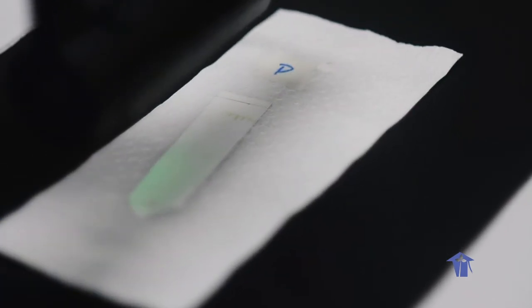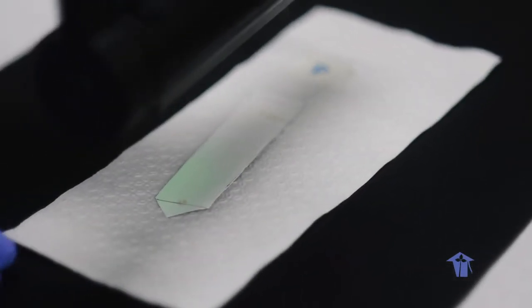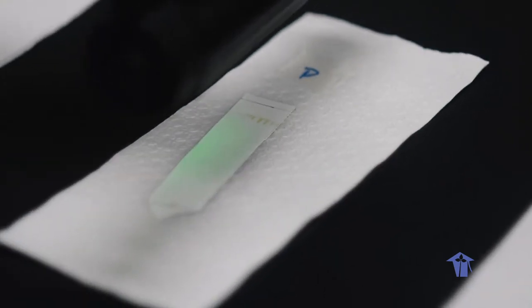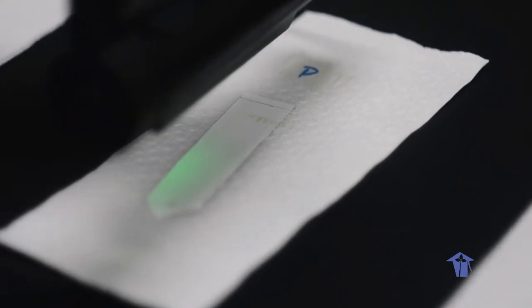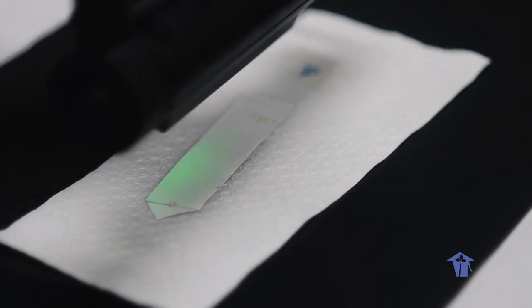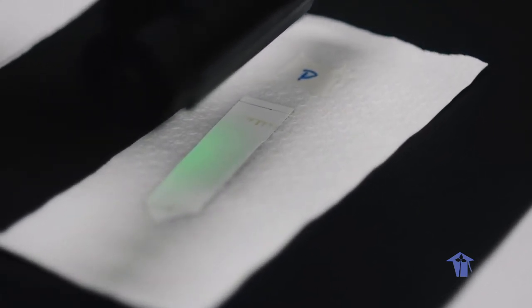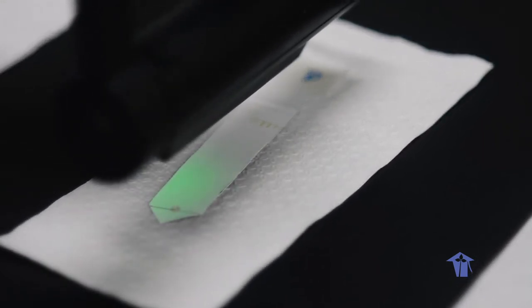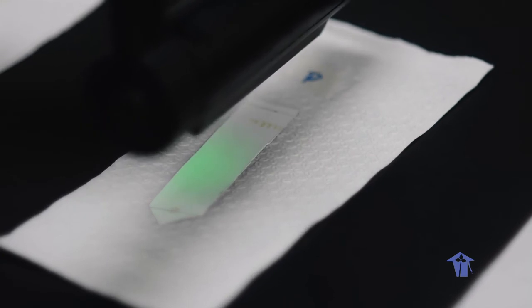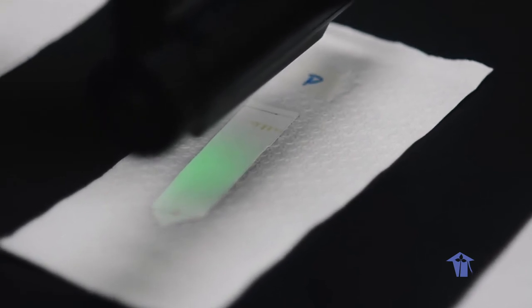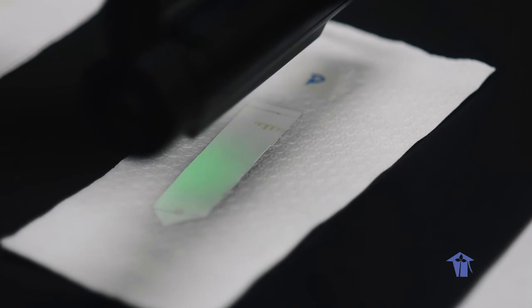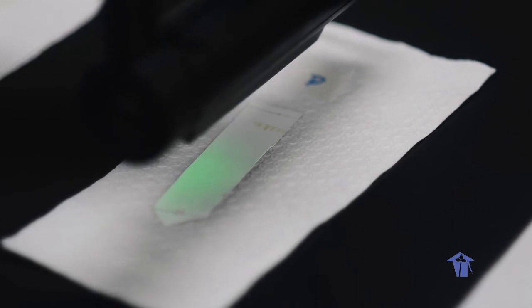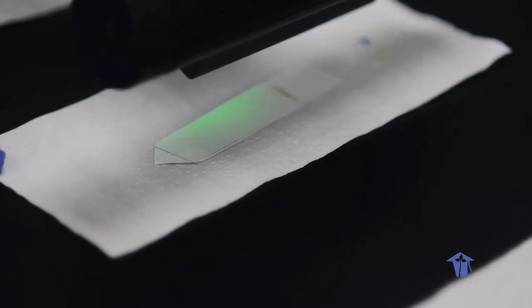We are going to move on next to the one that was taken from the pak choy. I'm just moving the UV lamp slightly up and down to give you some views of what has happened to it. Next one is the sample that was taken from kale.